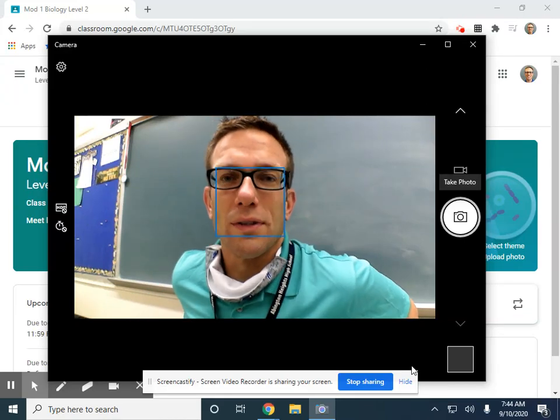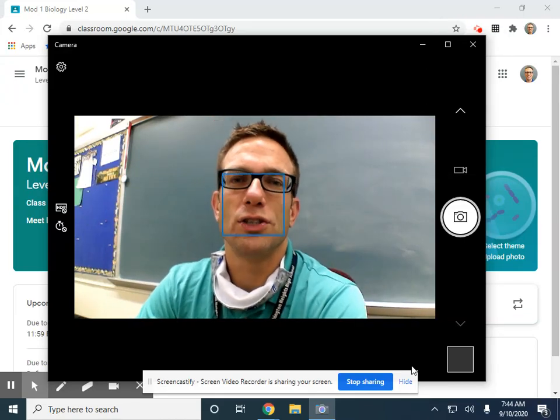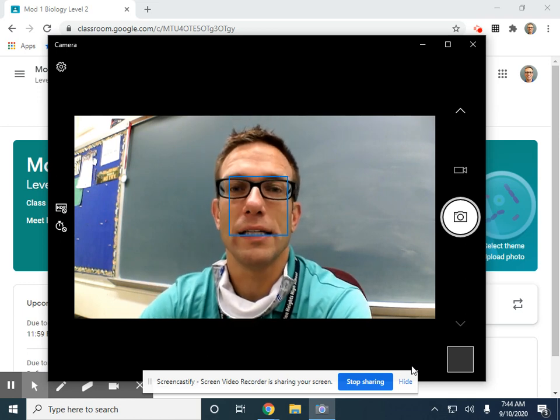Hi guys, this is Mr. Rollins here, and I want to show you how we're going to set up our radish seed germination lab.